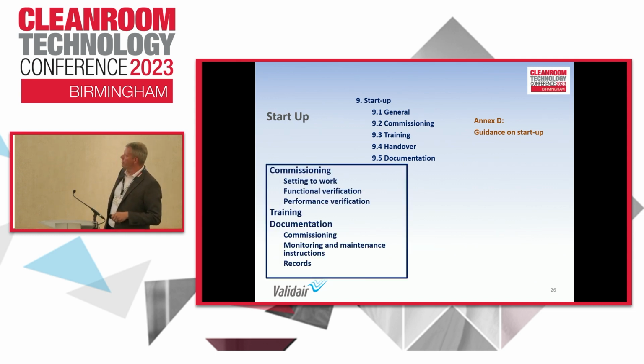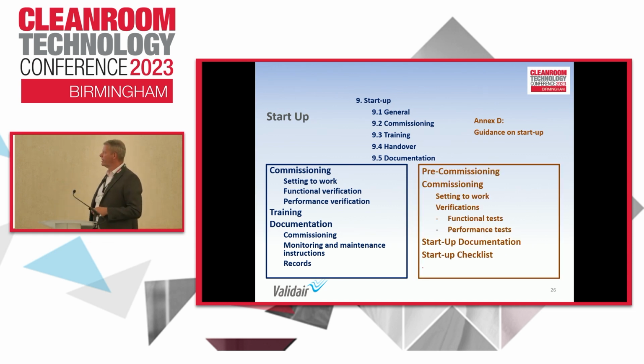deals with. So the commissioning period has a setting to work, has functional verification and performance verification. They're what we kind of call OQ in our pharma world, but they're separated just slightly by what that means within that section. Then there's a bit about training that needs to be provided and what documentation is handed over at the end. And the annex gives you a bit more information on all of those elements.